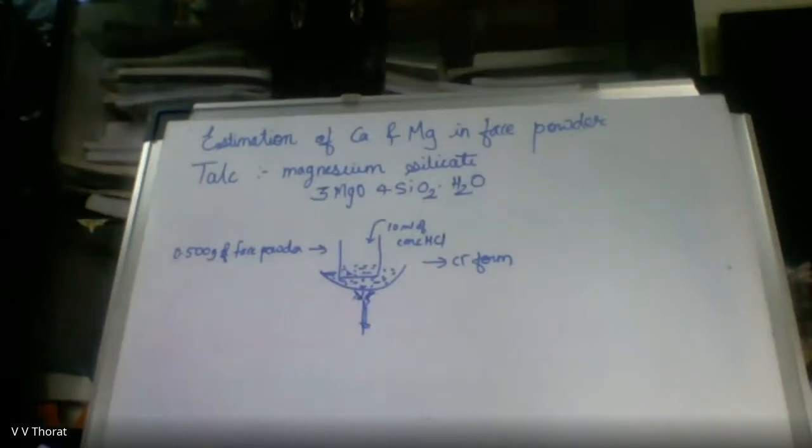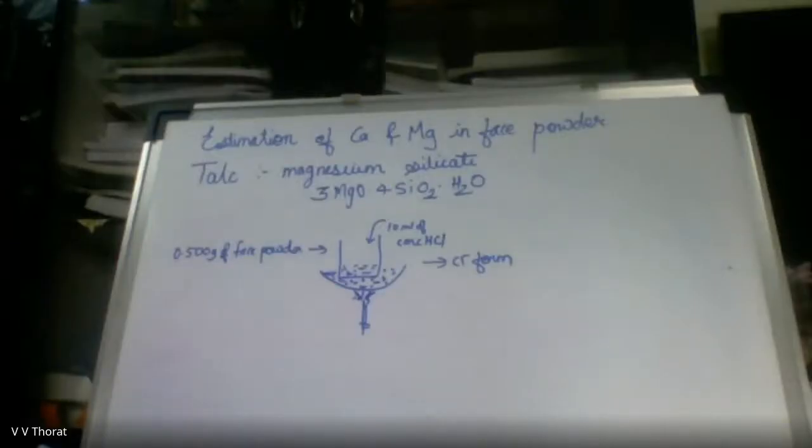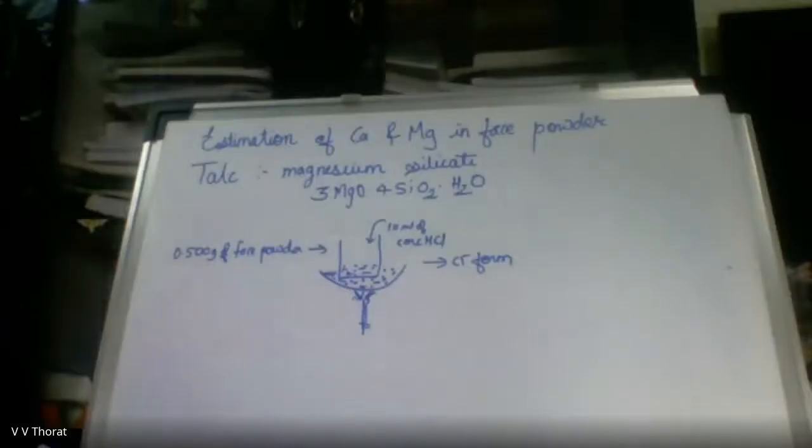Yes, who will tell me what I have explained till now? Preeti, unmute yourself. Preeti, first tell me, is my voice clear or echoing? Clear, ma'am. Very good. Now tell me, what is the aim of today's practical? Estimation of calcium and magnesium. Yes, the aim is to estimate calcium and magnesium in face powder, right?